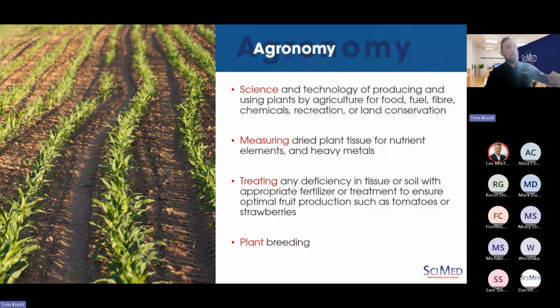As I said, why might that be important? Well, when we consider the study of agronomy, the soil, as I've already highlighted, is the first point of call as to how foods, feeds, and primarily the plant matter are going to develop, grow, and take up. But XRF doesn't just start and stop at the soils. You can also take samples of the dried plant matter, or even wet plant matter, though dried just helps the sample form a little, compress that into a little cup and measure it directly and get that deeper understanding of what my elemental understanding of the soil was versus what's the uptake into the plant.